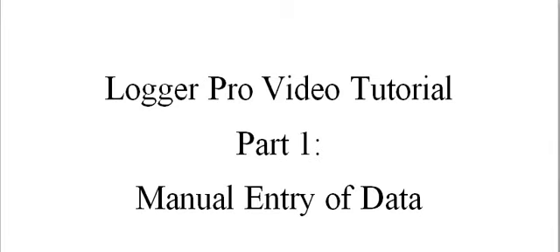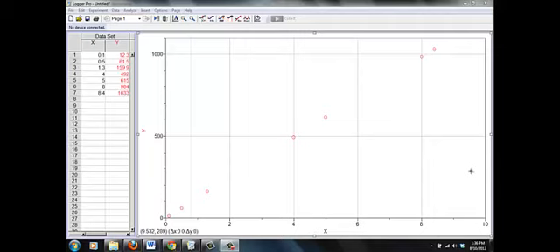Hello, this video today is a Logger Pro video tutorial just to show you a little bit about the basics of using Logger Pro. In this first part of the video, I am going to show how to input data manually into Logger Pro, supposing you just have some data that you took in a lab or wherever and you want to just input it yourself.